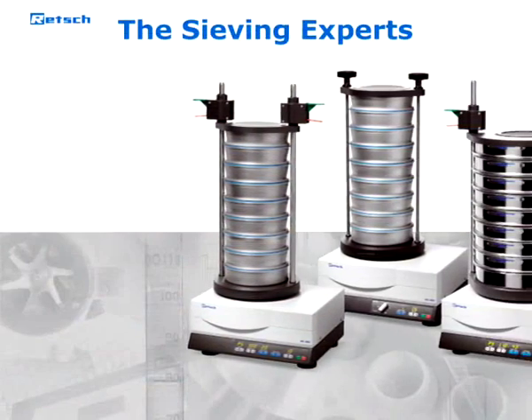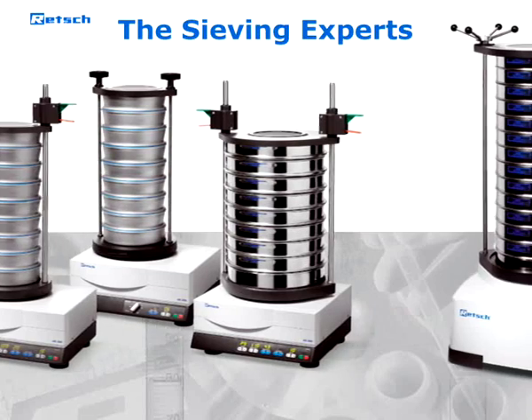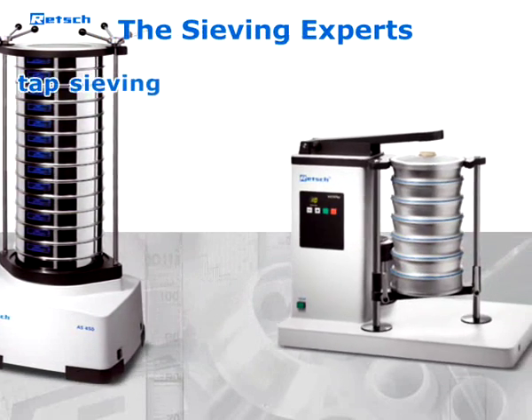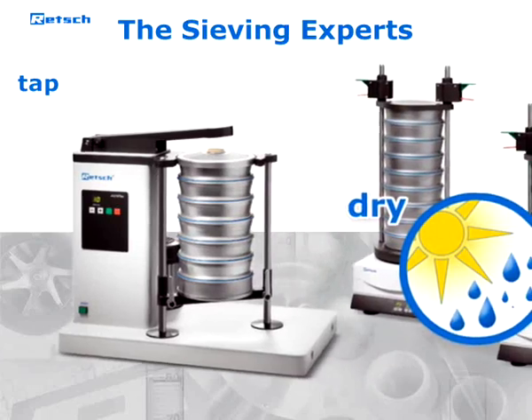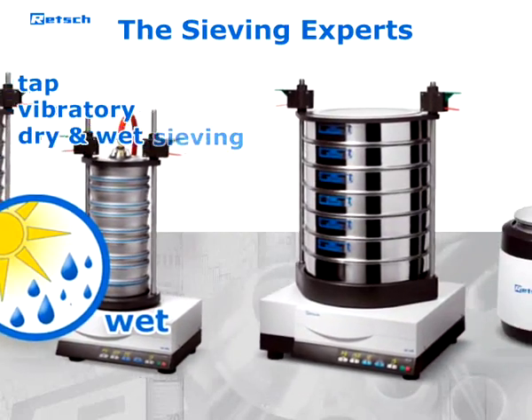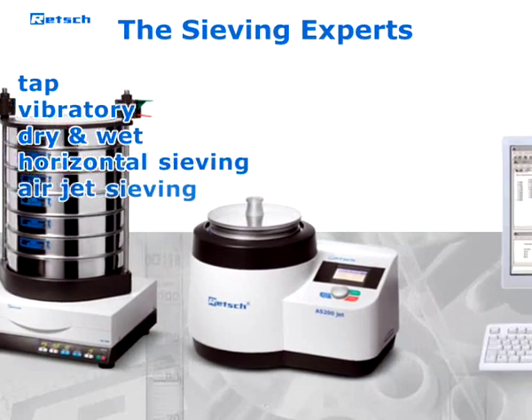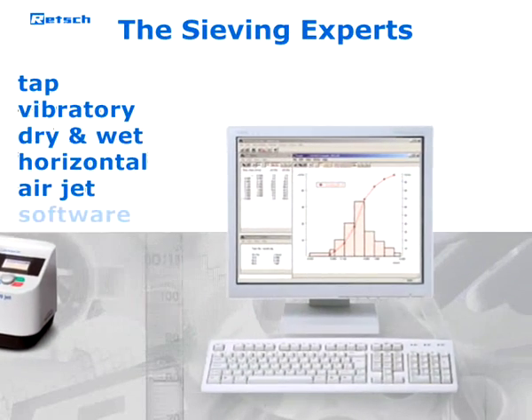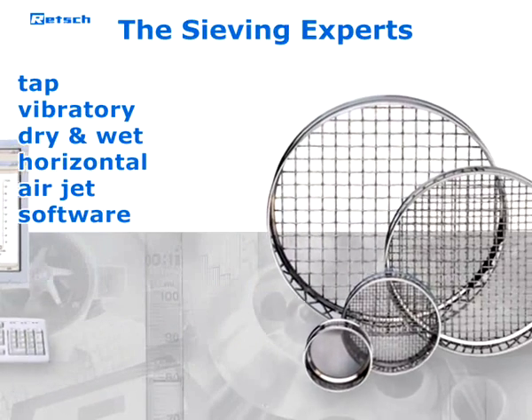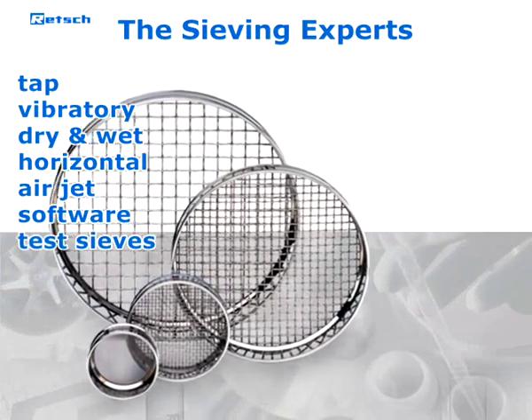As an expert for sieve analysis, RETCH offers the greatest product range in this segment. In addition to the AS200 TAP, the program also includes vibratory sieve shakers for dry and wet sieving, as well as instruments for horizontal and air jet sieving. The EasySieve software for automated evaluation of sieving results and the high-quality test sieves complete the line of products.